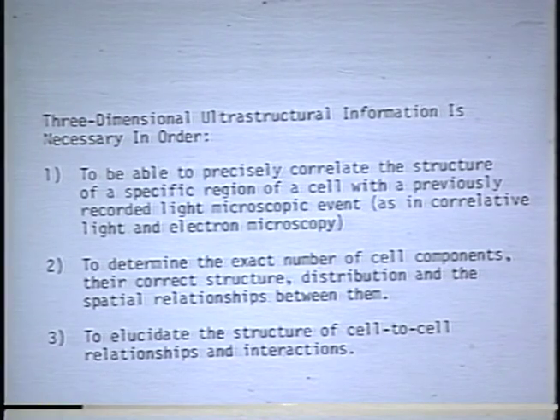And on a higher level of organization, to look at cell-to-cell interactions. For example, I'm a neurobiologist, and I'm very interested in the synaptic connections between receptor cells in the taste bud and the sensory nerve fibers. So using thick sections can help me to image and get an appreciation for the three-dimensional nature of the synaptic connections that I look at. Next slide.